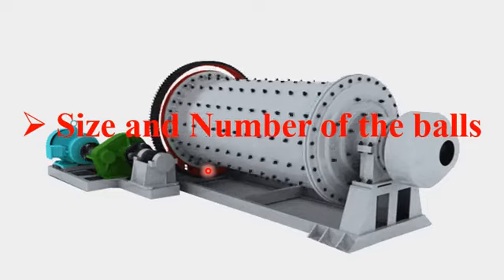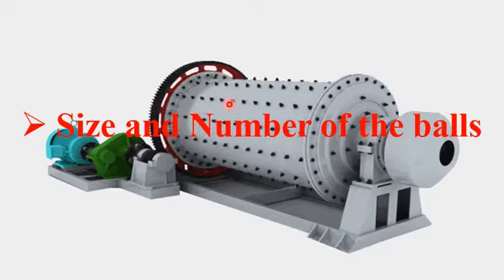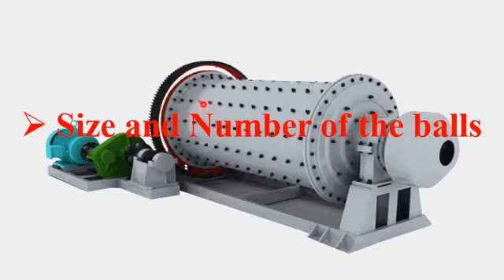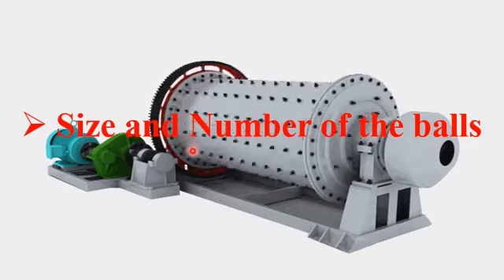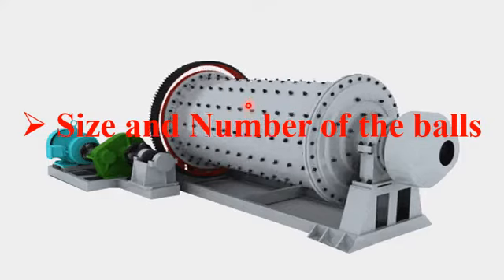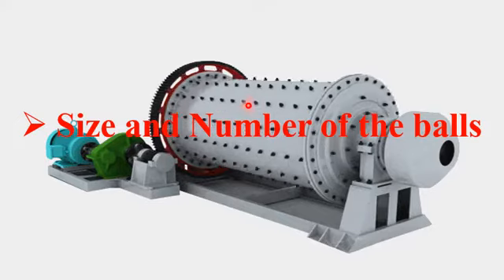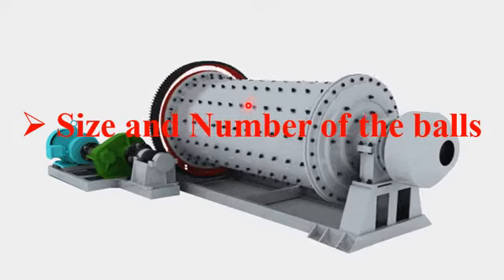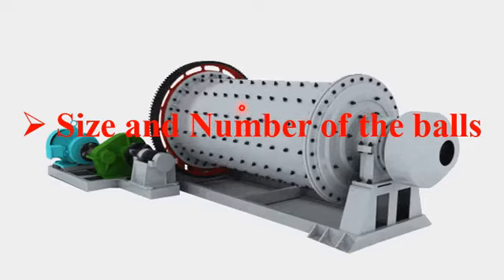In a new ball milling apparatus, usually 30% of the volume of the mill drum is used for milling balls, and this may be increased over time in order to increase the efficiency of milling the bulk material.